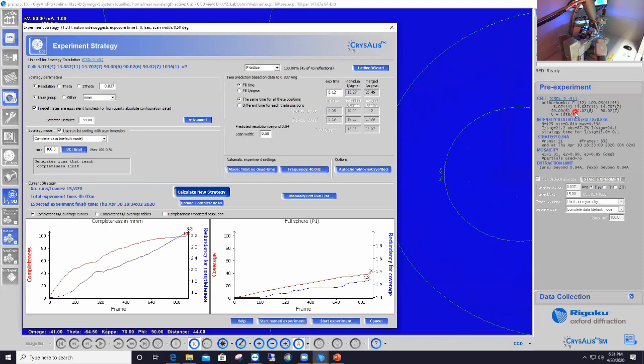But again, remember, it doesn't have to be as such. Sometimes after screening, your unit cell parameters might still be slightly wrong because you just don't have enough data yet. However, at this moment, it is critical that this indexing be correct, because you're going to calculate your strategy according to those unit cell parameters, and therefore they must be correct. So make sure that you have a percentage now of indexed reflections that is pretty high.